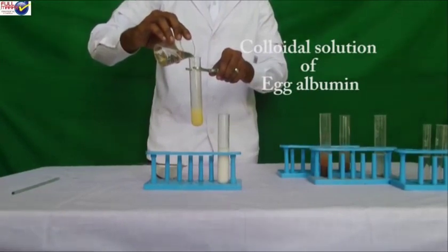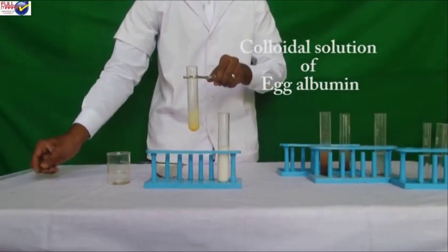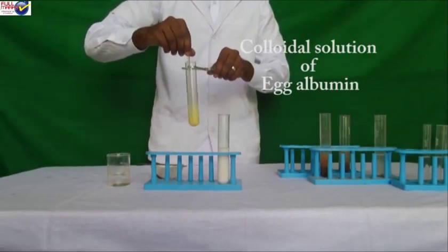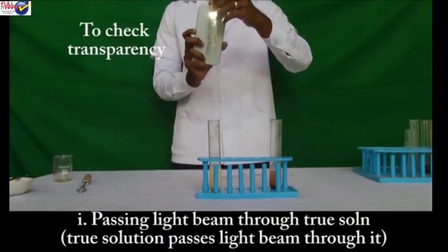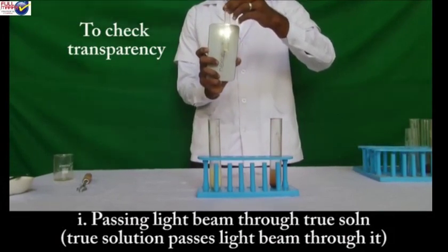Colloidal solution of egg albumin in water. Take 10 ml of warm water in a test tube. Separate the white portion of the egg from the yellow part. Add a very small quantity of egg albumin to the test tube. Stir the contents thoroughly with the help of a glass rod. To check transparency, place 3 test tubes on the stand and flash a beam of light to check the transparency. Record your observation.